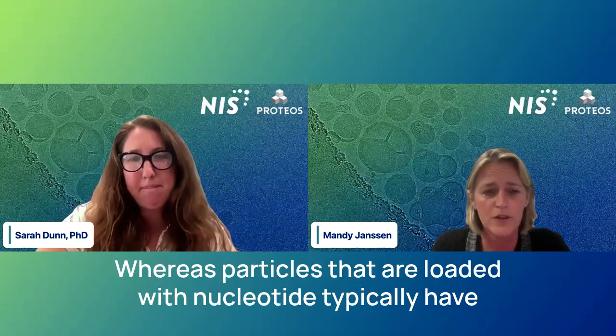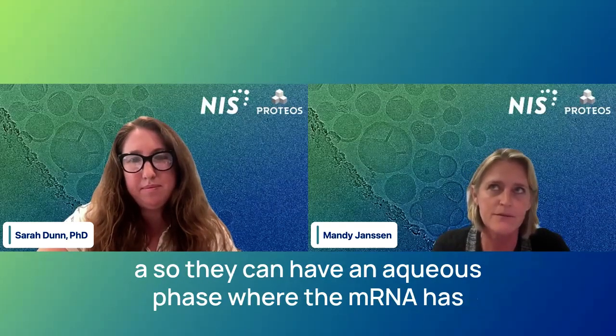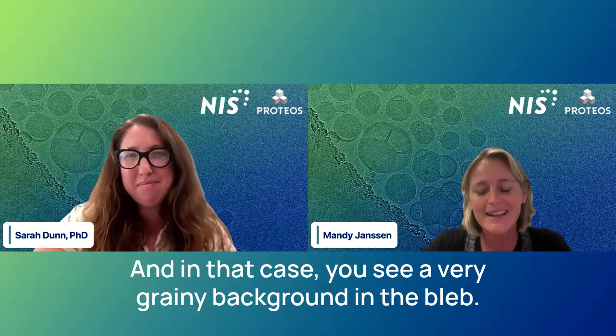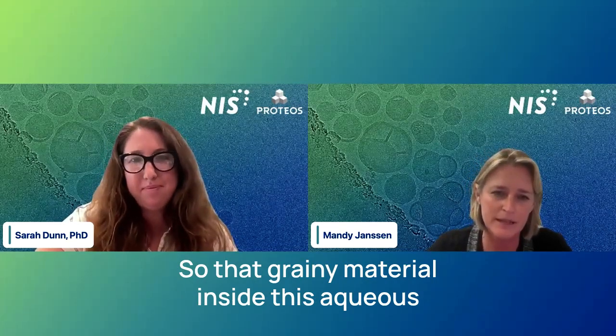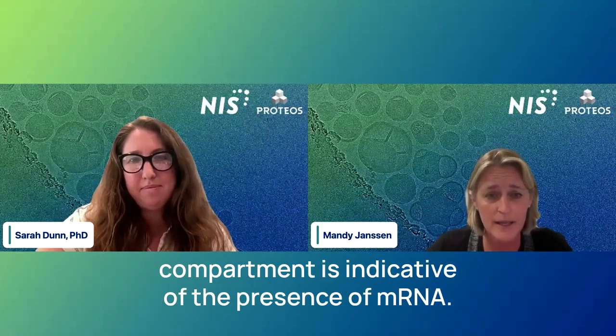Whereas particles that are loaded with nucleotide can have an aqueous phase where the mRNA has migrated into this bleb. In that case, you see a very grainy background in the bleb. So that grainy material inside this aqueous compartment is indicative of the presence of mRNA.